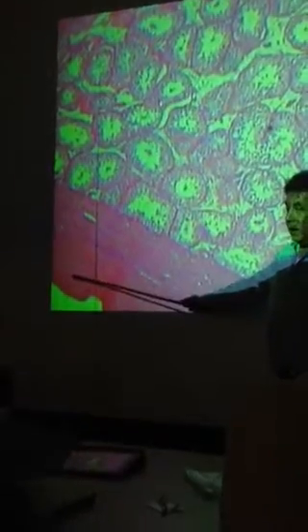Name the organ. Testes. You sure? You should be. Okay, it's the testes. What's this from here to here? Tunica albuginea. It's the white covering made up of collagenous fibers. This is tunica what? It's got blood vessels.